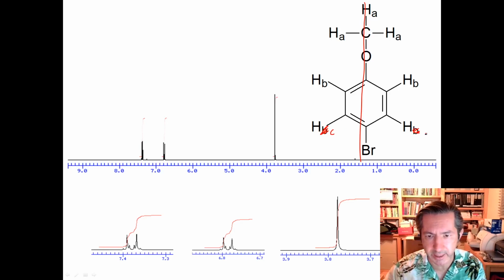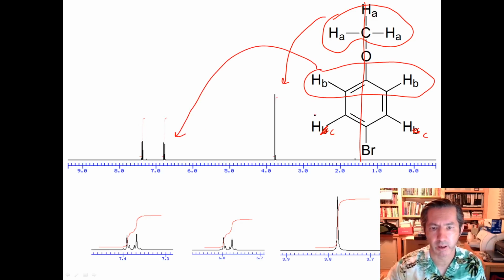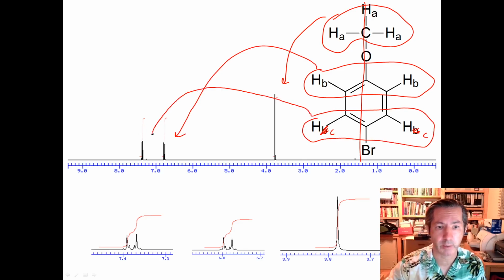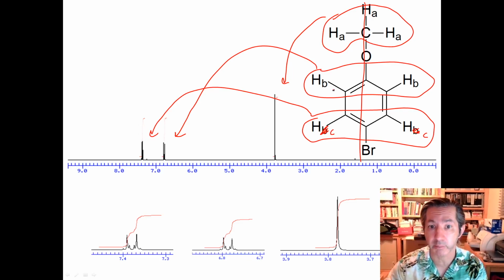That's HC down there. So we have HA showing up here. HB, that shows up right here. I'll show you why that does later on. And HC showing up here. And so what happens, HB has 1 next door neighbor, so he's going to be a doublet. HC has 1 next door neighbor. He's going to be a doublet.